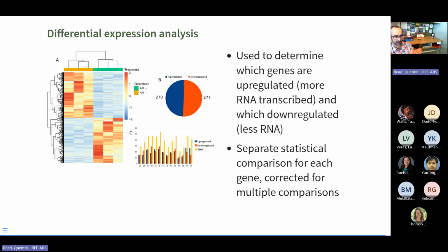Basically you're just doing a separate statistical model for every gene in your RNA-seq data set, and then doing a correction for multiple comparisons. That's kind of the old school way of dealing with multivariate data, and it's still a good way. So I felt it was a good one to talk about, because you all also use it in your papers. And if you've ever seen the DESeq2 package in R, that's the one where it's implemented. That's what we're going to use today.